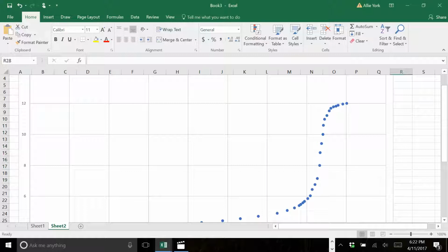Right now, we're going to find the rough value of the pKa, but first we need the equivalence point. So you want to see what value has the largest pH change, with the smallest amount of sodium hydroxide added. So here we have 14.65 mils at a pH of 8. And then if you add 0.03 mils, it increases by 0.82 pH units.